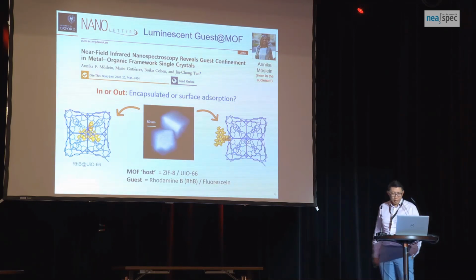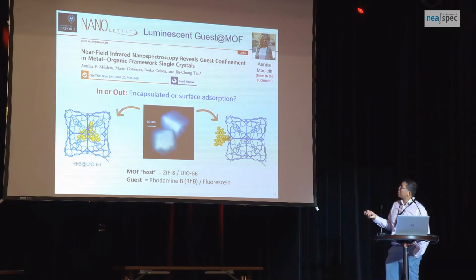The work was performed by Annika here. As far as we are concerned, this is the first study on MOF materials where we have used the tool very comprehensively and rigorously to probe the physical and chemical behavior of a single crystal. So this is a ZIF-8 or UiO type material, which we reported in this manuscript. In this set of slides, I'm just going to talk later about ZIF-8.